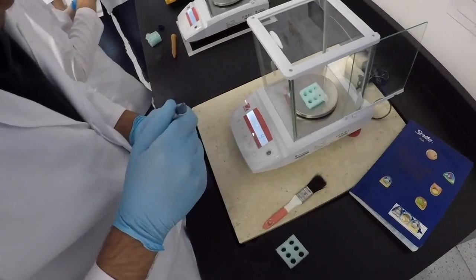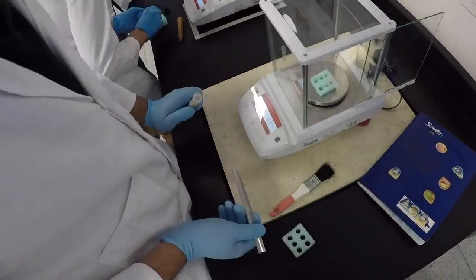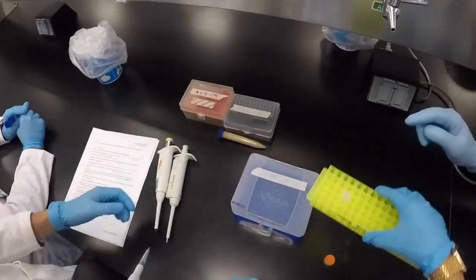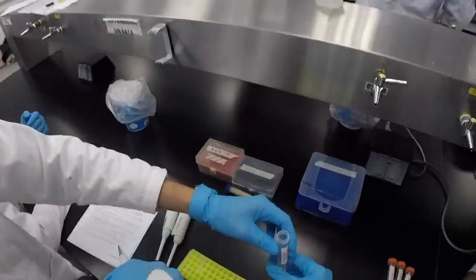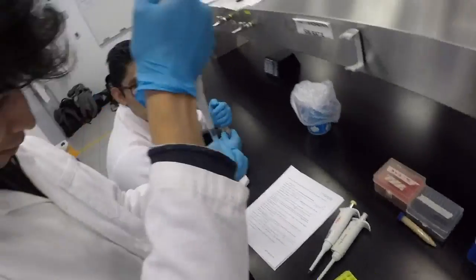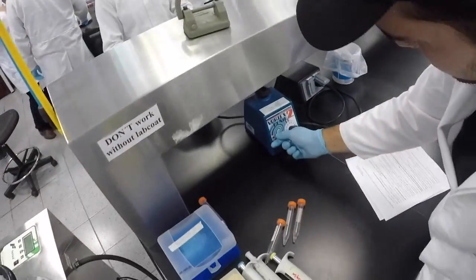The first step in the protocol was to weigh 20 milligrams of dried plant tissue, in this case the ginger rhizome. Next, 600 microliters of extraction buffer were added to the microtube, and the solution was mixed with a vortex.